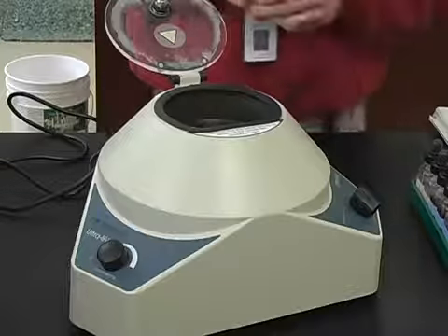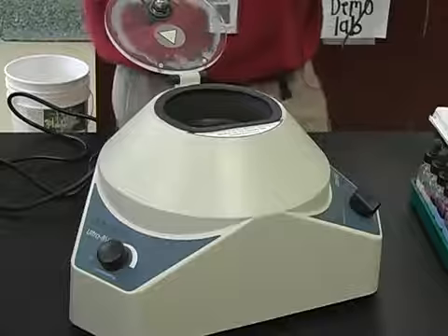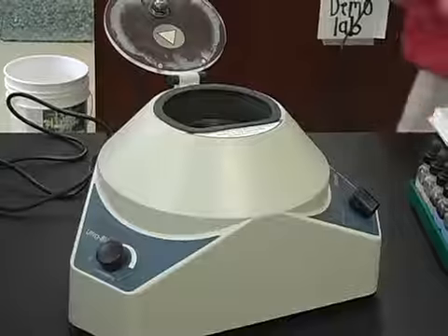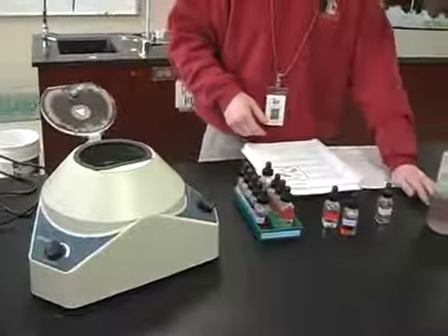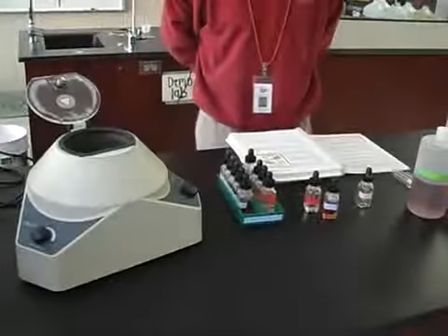So it's best just to find something else to do for a little bit, and that's why some people run 2 sequences of the solution at the same time. They'll centrifuge one, and then they'll go read and do the reaction for the next part while it's centrifuging. Then when it's done, they'll swap, and they'll take one test tube out and put another one in. Okay, that's centrifuging.